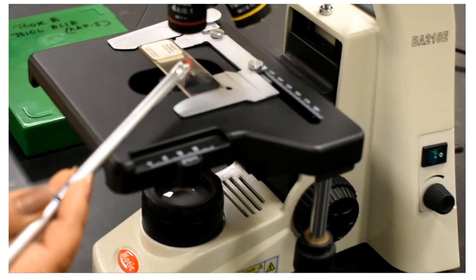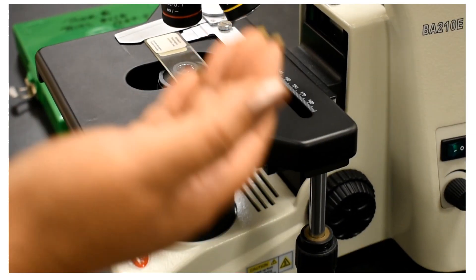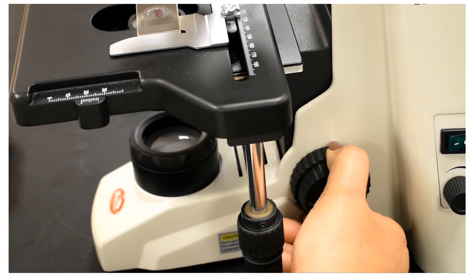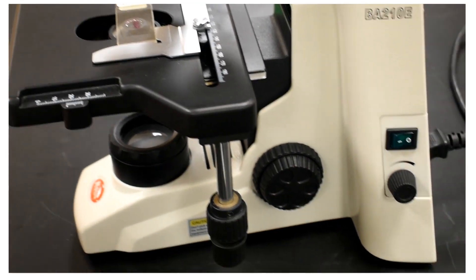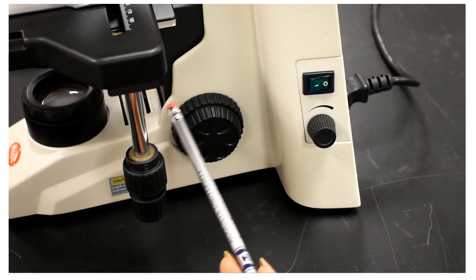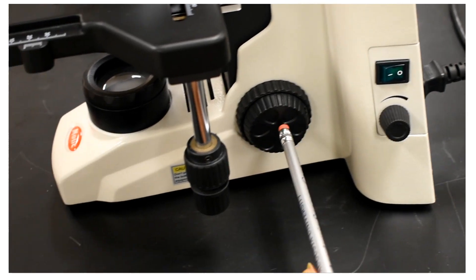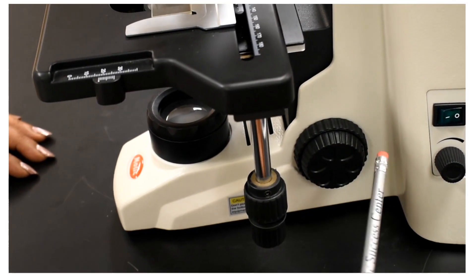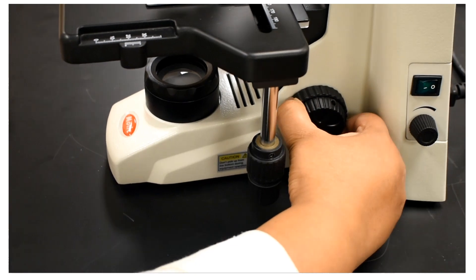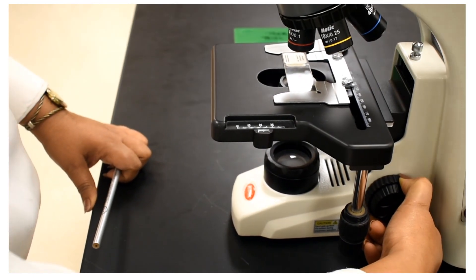Continuing upwards, the stage can be moved up and down using a knob on the side. There are actually two separate knobs: the bigger one is called the coarse adjustment, and the smaller one is called the fine adjustment knob. The size of these knobs may differ from microscope to microscope, but the function is the same — we move the stage up and down, and these controls are necessary to focus the object clearly.